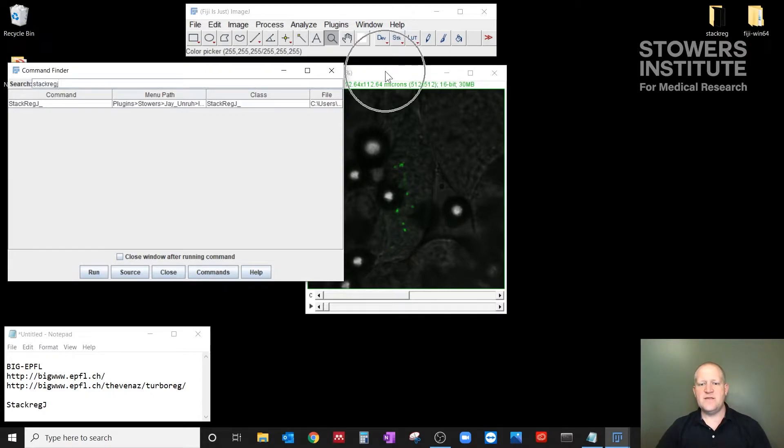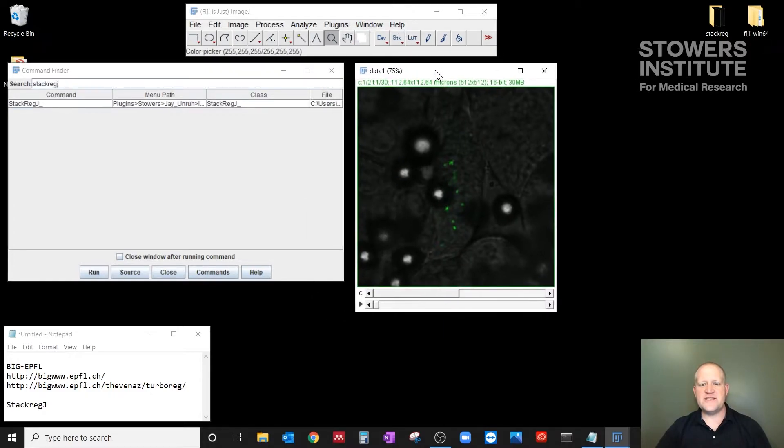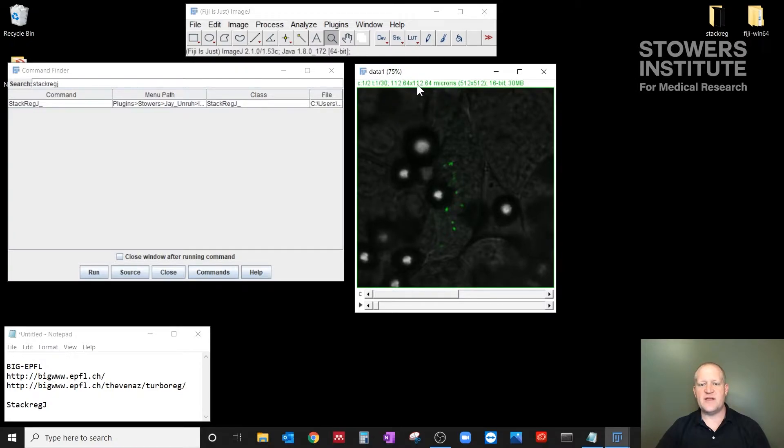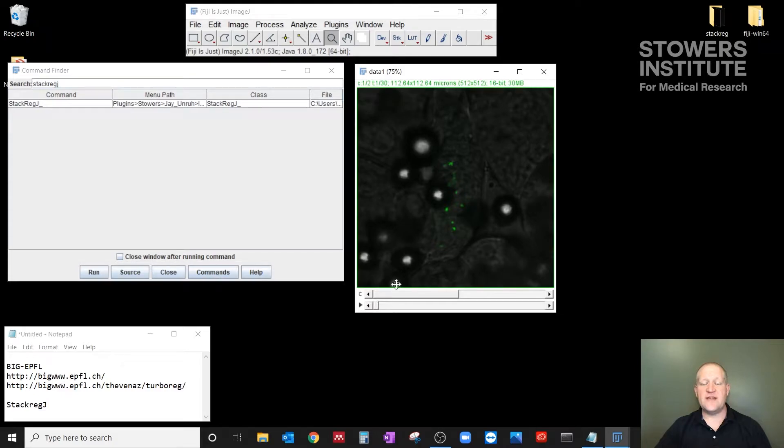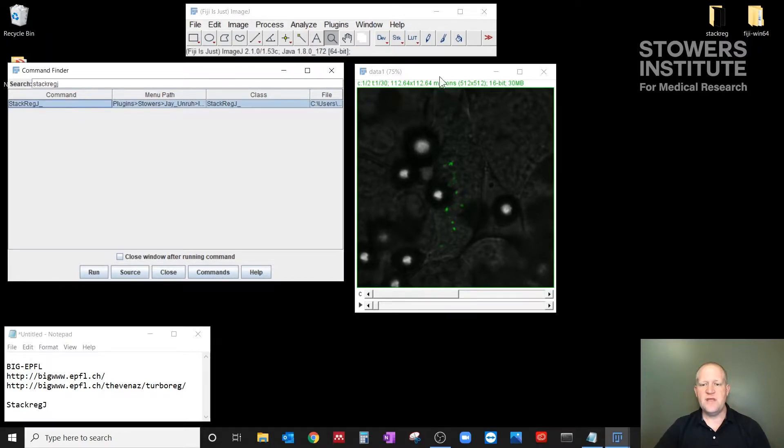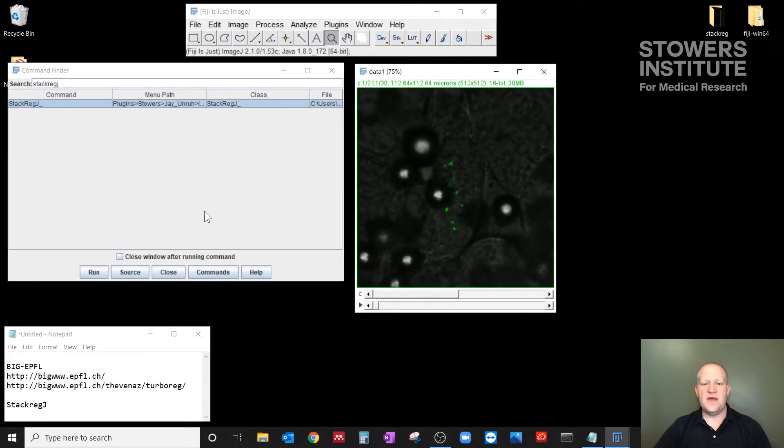Okay. So in the first instance, I'm going to focus on the fluorescence channel, and I can tell that because of the green here. And I'm going to align everything to the first frame of this movie. So I'm going to select the StackRegJ plugin here. I'm going to select the window that I want to register, and I'm going to go ahead and click Run here.